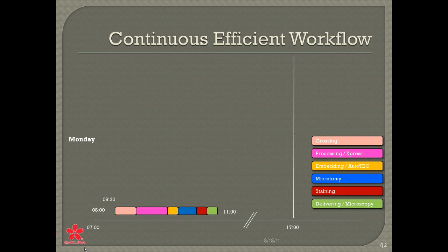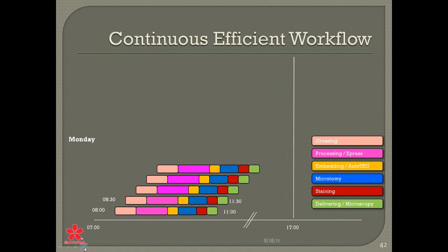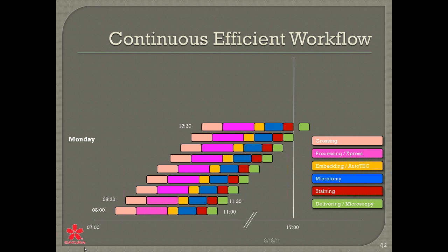And 30 minutes later, or 15 minutes later, depending on the program you have, you can start this whole process again. And then you're finished at half past 11. And this can go on and on and on. But then you will say, yeah, but you're going home at 5 o'clock in the evening. And it's true. So at 1:30, we aren't able to deliver it anymore to the pathologist. That doesn't matter.